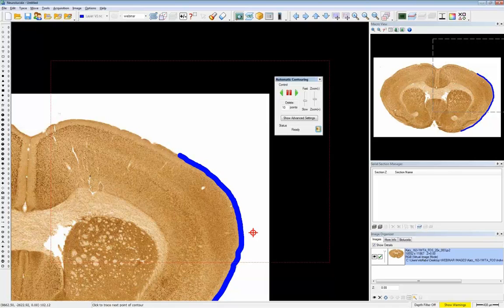It found it and now it's going again. So if you notice that your auto contour strays while it's going and doesn't stop, you can stop it yourself, back it up, and then interactively get it going again by clicking on the border a couple times. So let's start again. Keep it going slow since we seem to have a slow video feed.